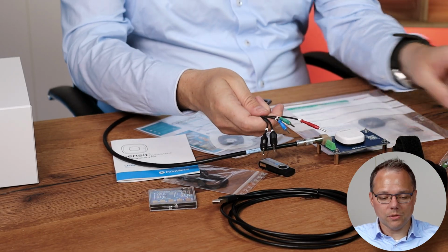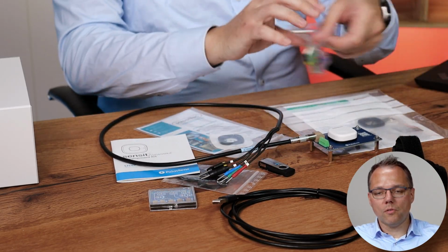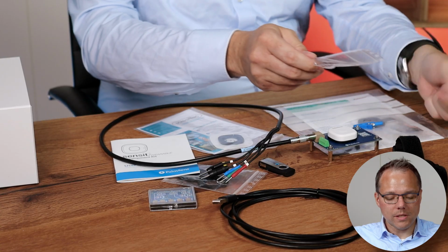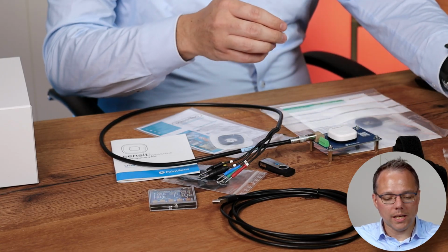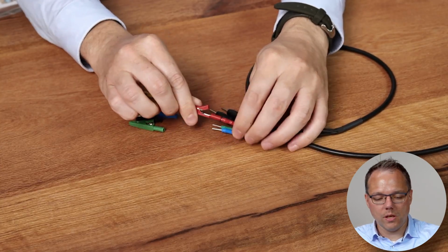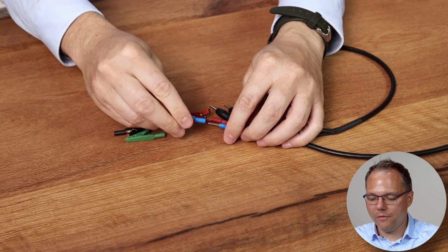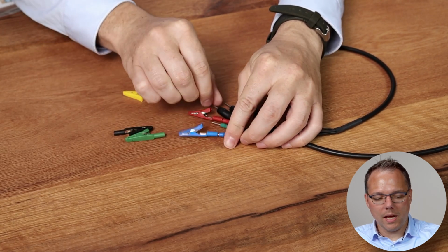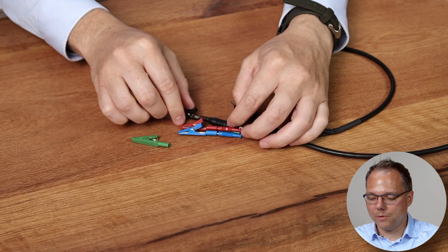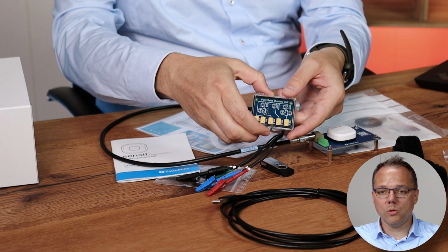Now I need to connect the crocodile clips. For this test measurement, I just require the reference, counter and working electrode. So I'm looking for the red clip for the working electrode, the blue clip for the reference electrode, and the black clip for the counter electrode. And these I'm connecting to our dummy cell.